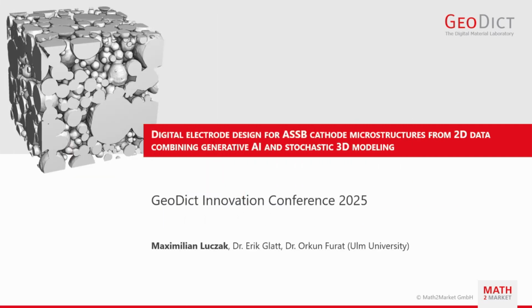My name is Maximilian Luczak, and I'm an application engineer at M2M's consulting and projects team. And I'm very happy to have the opportunity to give you a short introduction to GeoDict's abilities to generate 3D statistical digital twins out of 2D input data.